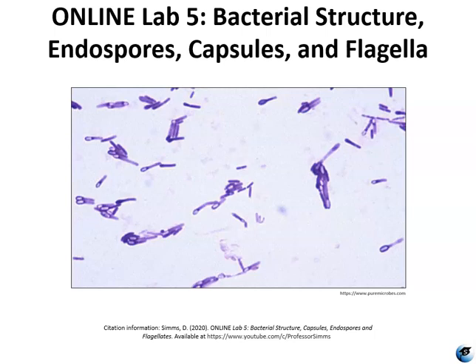Hello, I am Professor Sims, and in this video I will discuss differential staining of endospores, capsules, and flagella.